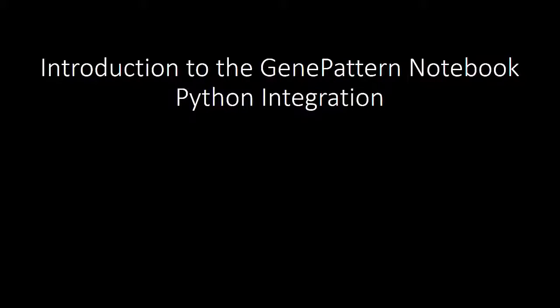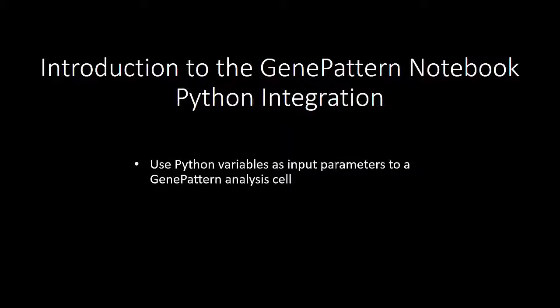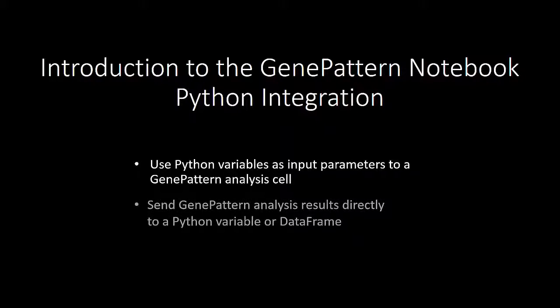In this video, we will demonstrate how GenePattern Notebook seamlessly integrates Python with GenePattern in a notebook by allowing you to use Python variables as inputs and outputs of GenePattern analysis cells. We will show how to use Python variables as input parameters to a GenePattern analysis cell, and how to send GenePattern analysis results directly to a Python variable or data frame.